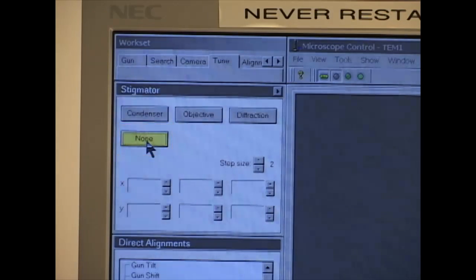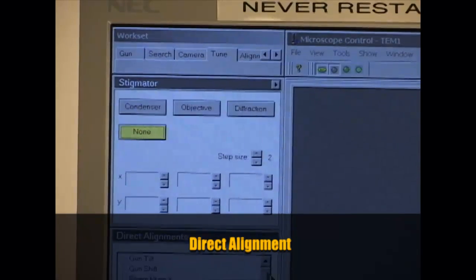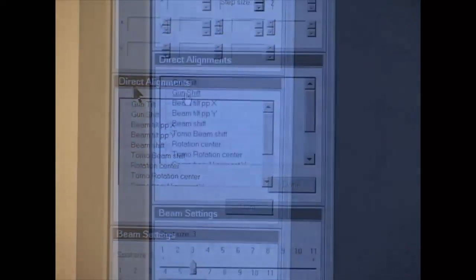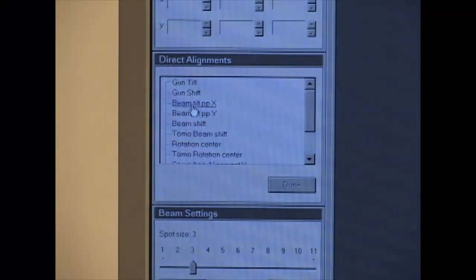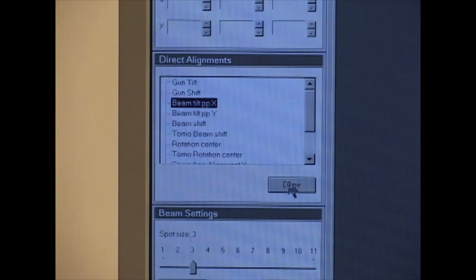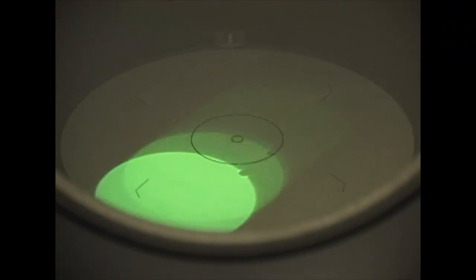Now we do Direct Alignments. Select Tune, User Interface, Direct Alignments, and Beam Tilt PPX. Notice that there appears to be two beams. Adjust multifunction X and Y until the two beams merge to one. Click Done to save this setting. Repeat the beam tilt PPY and adjust the multifunction X and Y knobs until there is one beam image.